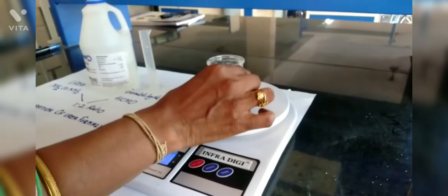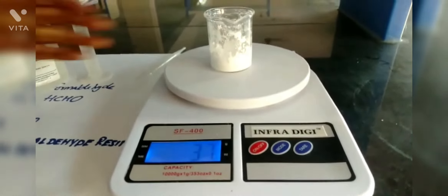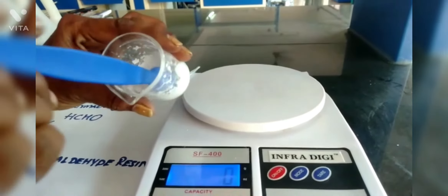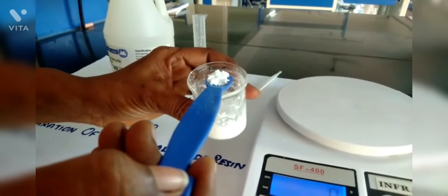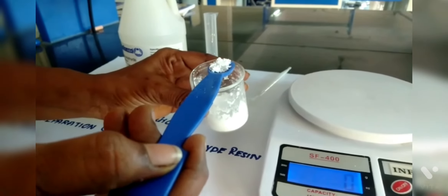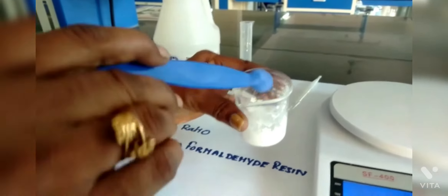When it cools down to room temperature, we can take the weight of it. The weight goes to 37 grams. That means 37 minus 29 — 29 being the weight of the beaker — gives 8 grams, which is the yield of the urea formaldehyde resin.